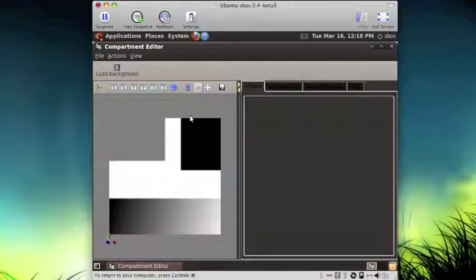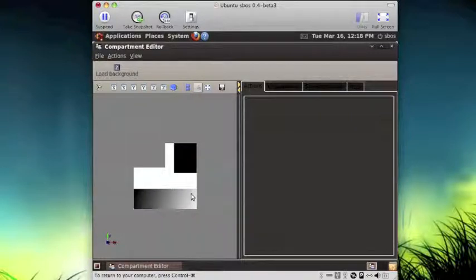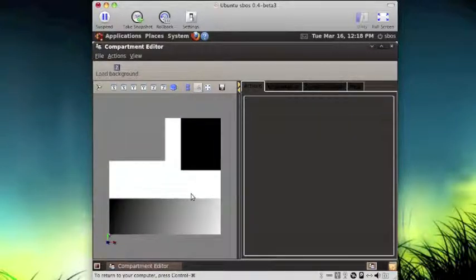This is basically an image which contains some gray, some white, some black, and some kind of gradient going. So we can zoom out, zoom in. This is what we do with the mouse. And now we can prepare a digital form of this image.